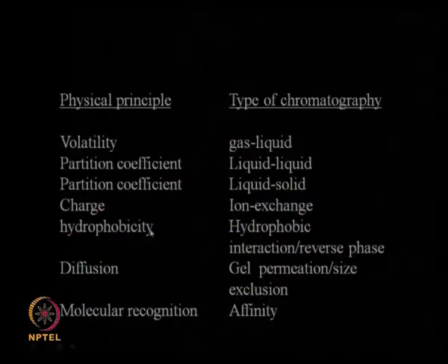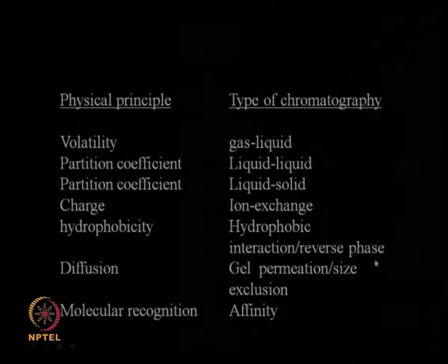If it is because of hydrophobic forces, then we have hydrophobic interaction chromatography or reverse phase chromatography. If you have very highly hydrophobic proteins, they may get bound to the hydrophobic matrix. Less hydrophobic or hydrophilic proteins come out, so that's called hydrophobic interaction chromatography.